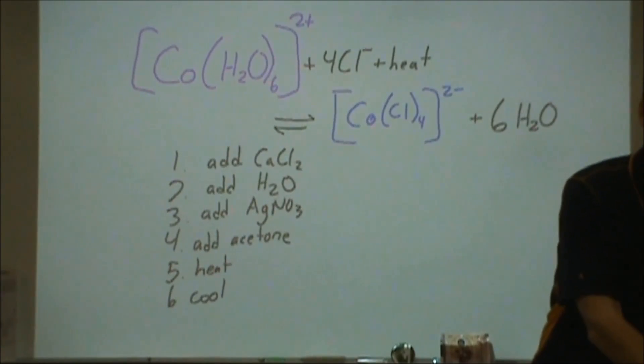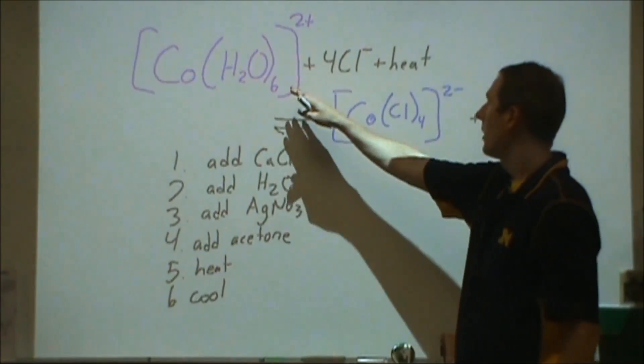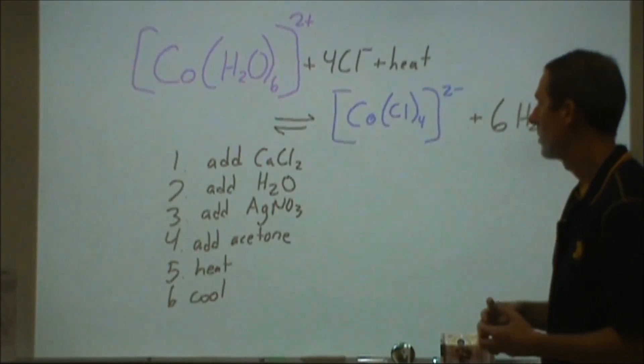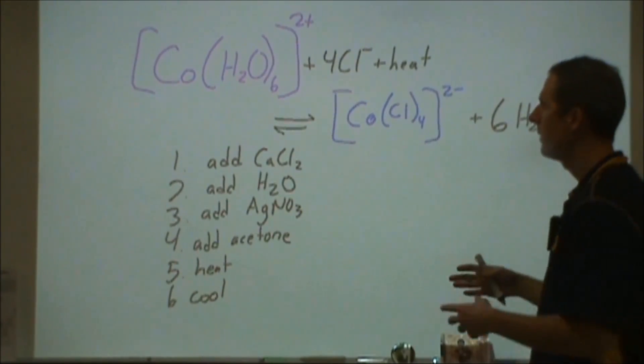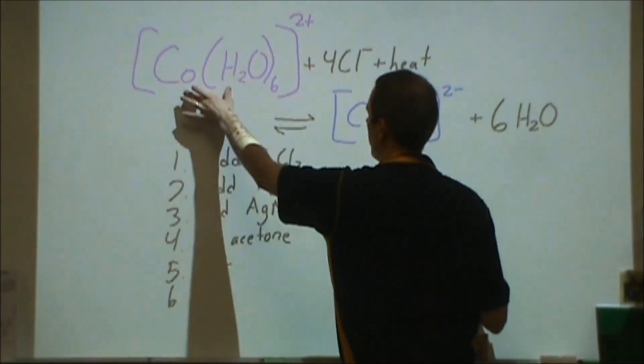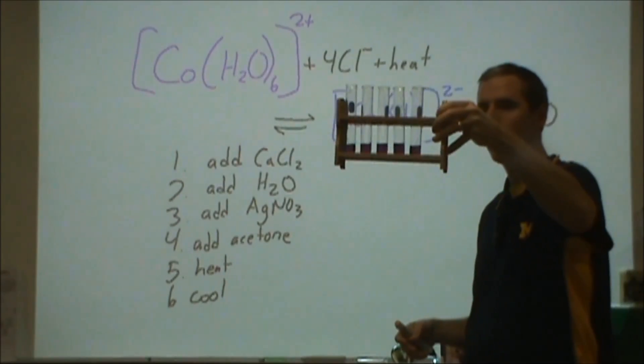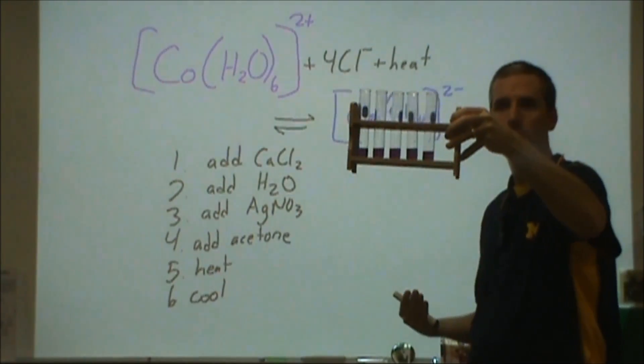So one of these complexes is a pink color when it's surrounded by water as the ligand, and when it's surrounded by chloride ions the ligand actually turns blue. What I have here is an equilibrium mixture where I actually have both of these present in appreciable quantities, and so instead of a pink or a blue color you're looking at a kind of purplish color.